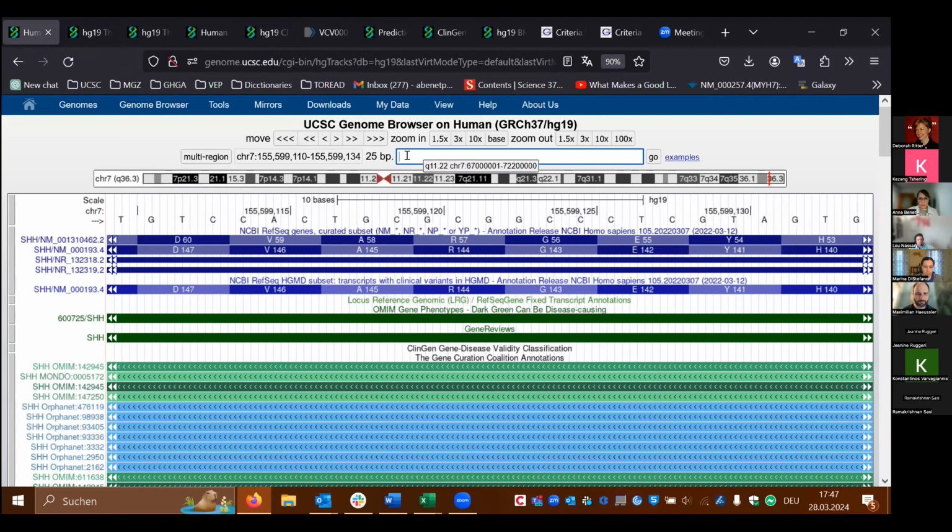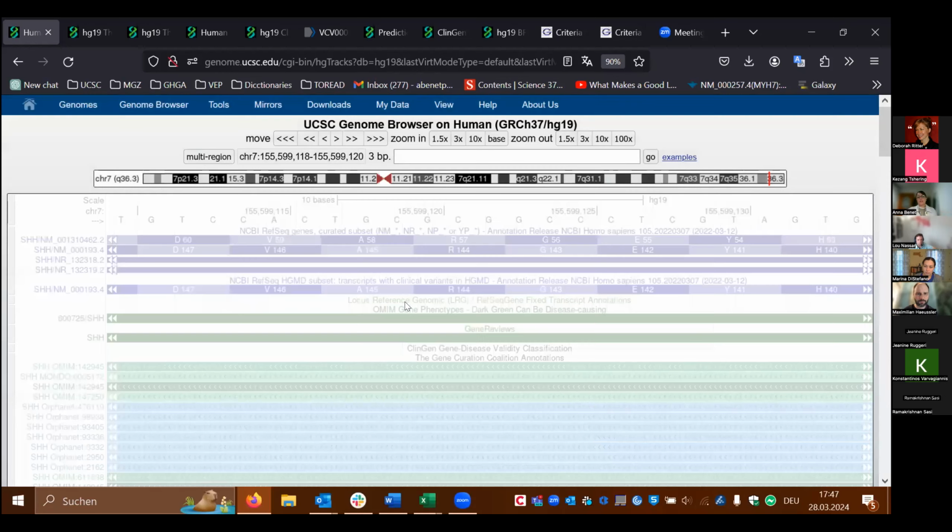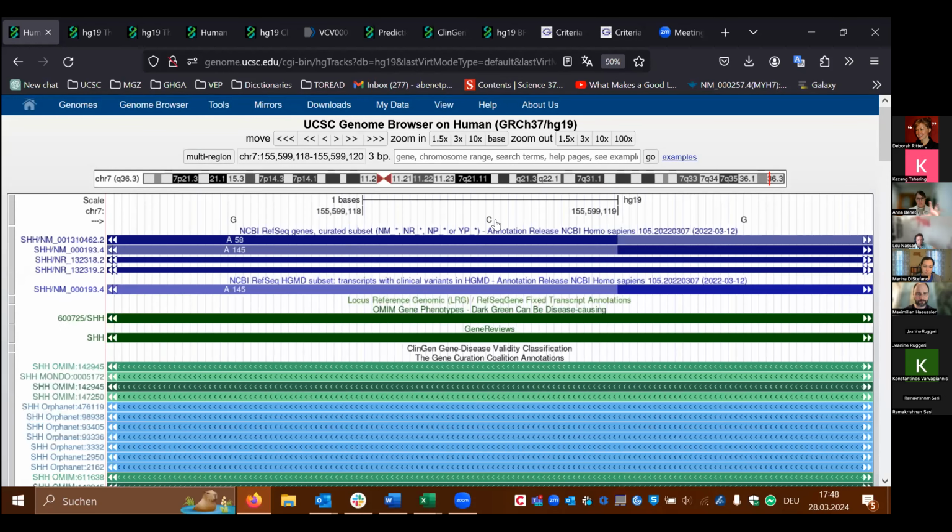This is done like this. Let's say I'm analyzing just this variant here, or this position here. Now I just zoomed in. See, now I'm zoomed in. So let's say I'm analyzing this position here, and I'm now in HG19. This is indicated here, and I want to go to the same position, but in HG38. So I go to View, Other Genomes, Convert.